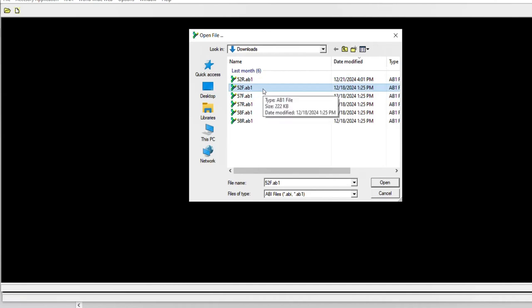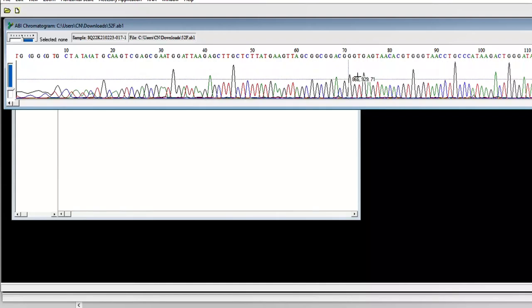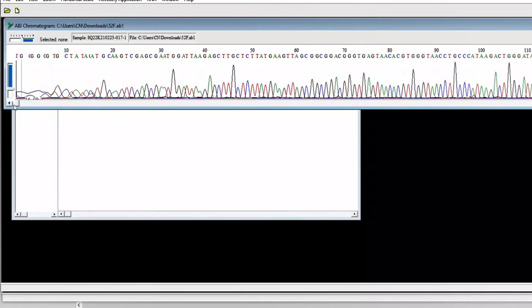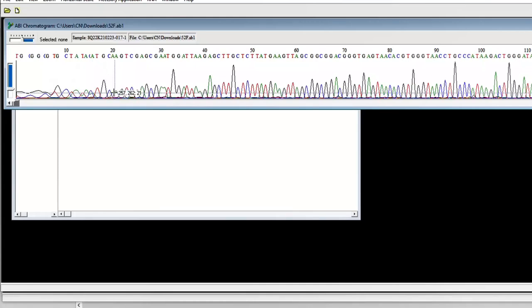I choose the forward strand of this sequence — this is the reverse, this is the forward — so I will first open the forward. You can see these are the sequences, the peaks, the sharpness — you can see the quality. In the beginning, the enzyme was very weak and there are no sharp peaks, but as you tend to position 20, the peaks begin becoming clearer.